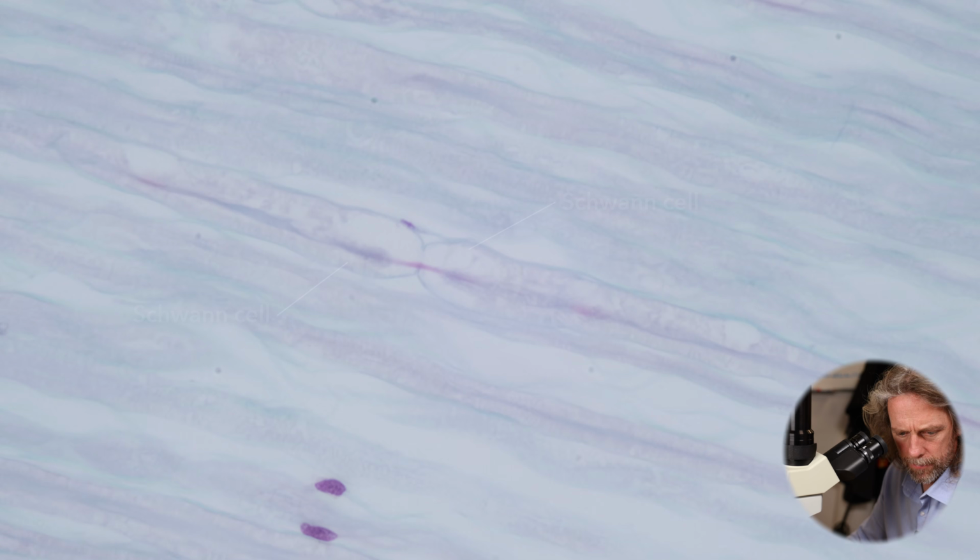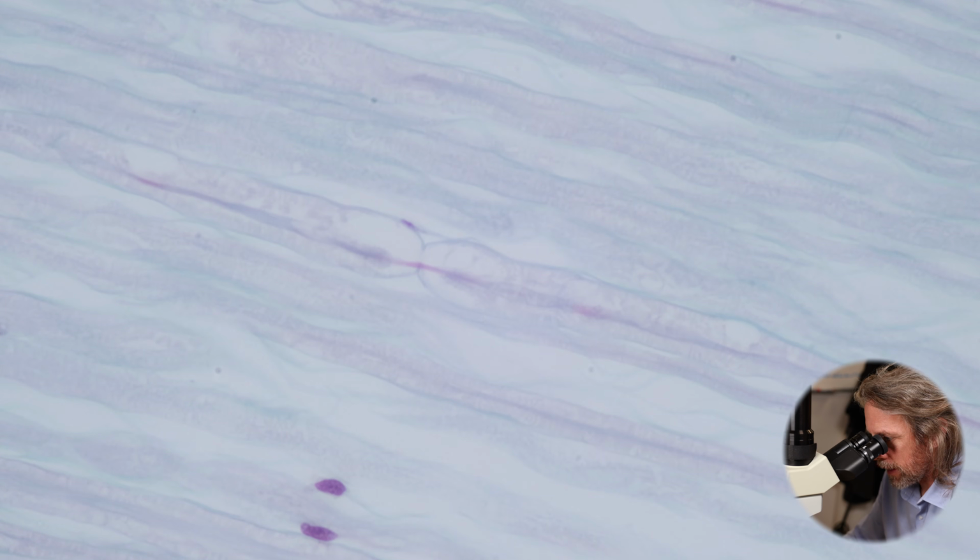So, what we're looking at there is an axon running across the screen, and we're looking at the Schwann cell covering it, and we can see where one Schwann cell meets the next Schwann cell. This has just caught the perfect plane of section so that we can see the node of Ranvier, the gap between those two Schwann cells, and that's where the cell membrane of the neuron will depolarize, and that action potential will jump to the next one.